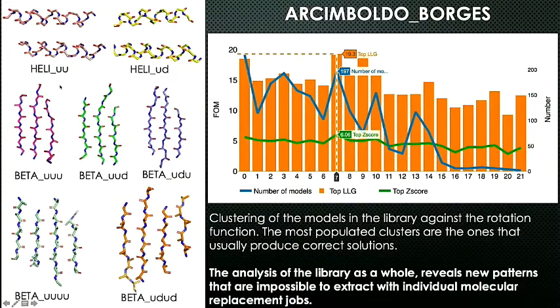On the left, you will see some examples of libraries that are already distributed in CCP4 that you can use, and you can see that these folds are very ubiquitous, so they can be found in different families. This is one of the reasons why we cannot just rely on sequence.